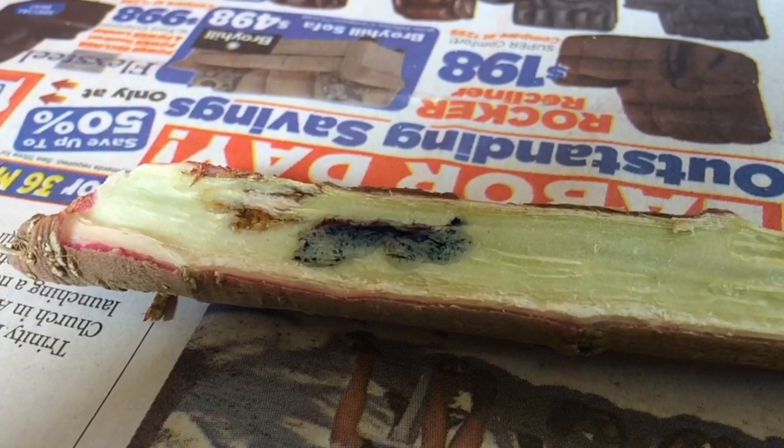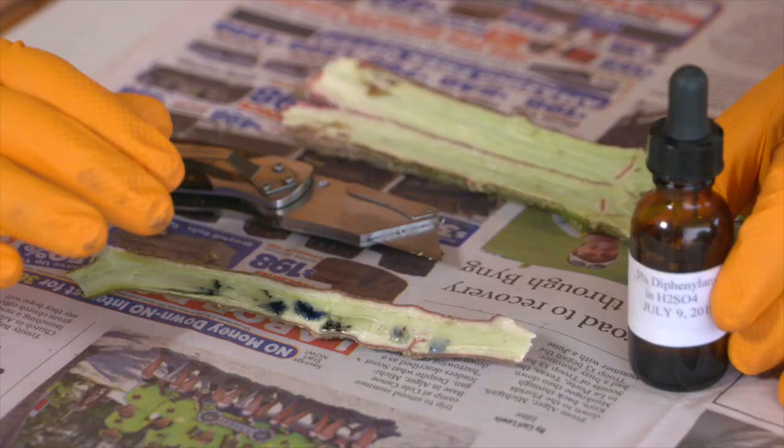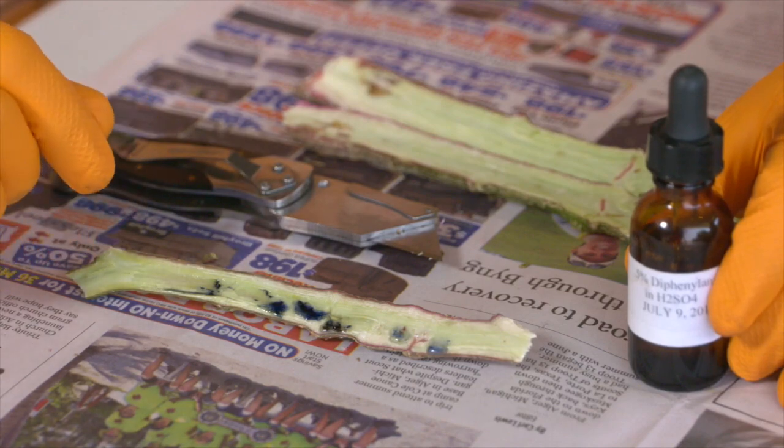So even if the reagent is one, two, or maybe even three years old, this can allow us to know that it's still working, and we can be confident in our recommendations to producers.